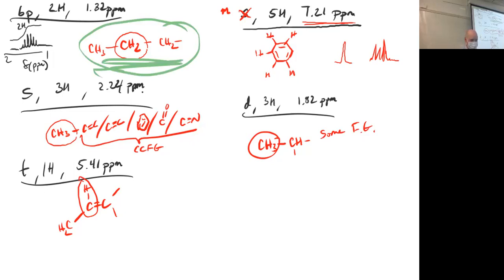But in this case, that's not right with nothing there, because we would expect this CH3, if it was just part of an alkane, to show up right around 1 ppm. And 1.8 ppm is way higher than 1. So it's got to be 2 doors down from something. If you were to write O/N/X, great. If you were to write carbon containing functional group over there, great. If you were to write really any functional group, that's fine. Because you don't know for sure, but it's got to be 2 doors down from something. Otherwise, it would show up around 1.